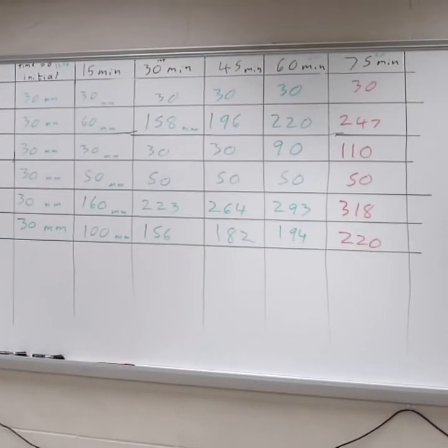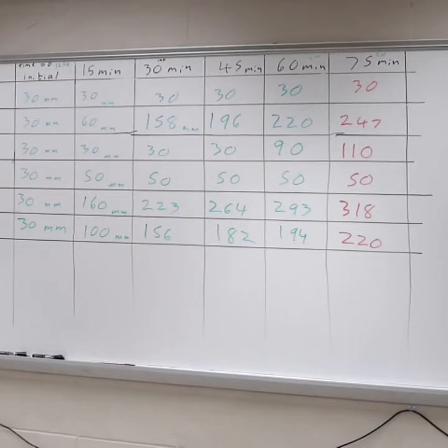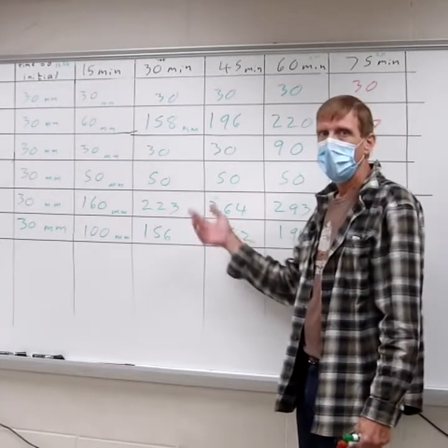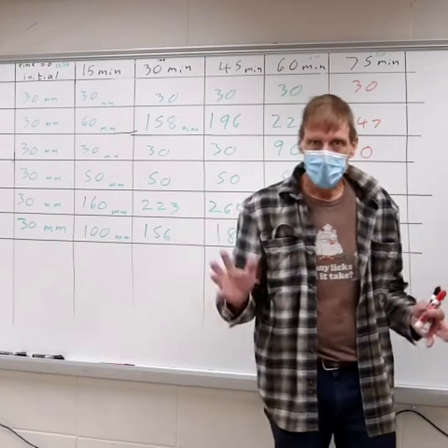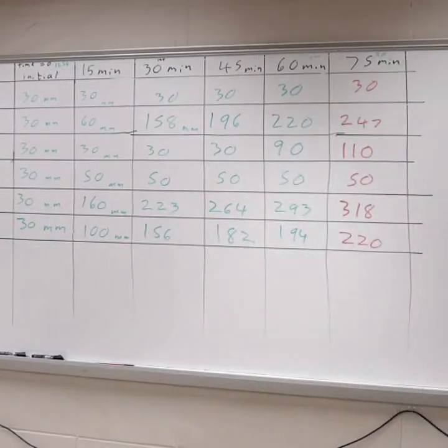That is your data. Now, I know you can't read it well on here. That's all right. This will be typed over this table. I'll fill it out. That'll be posted on Blackboard as your fermentation data. It'll just be a Word page. Now, what do you have to do?